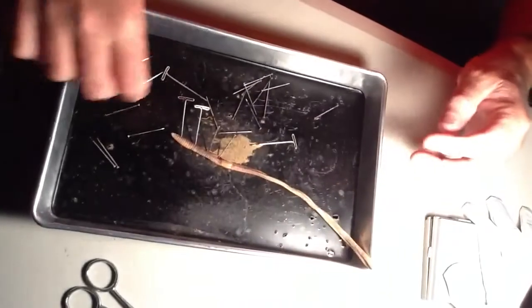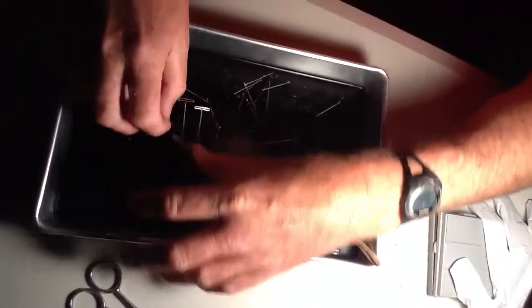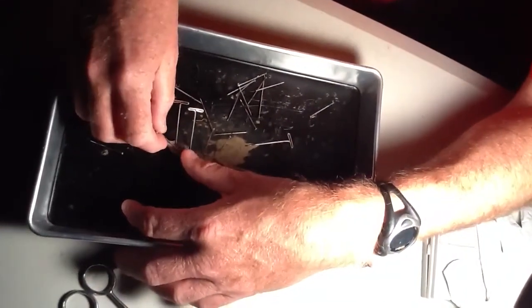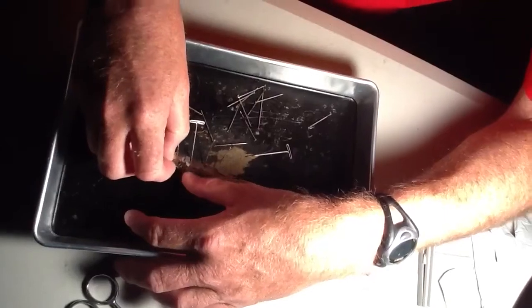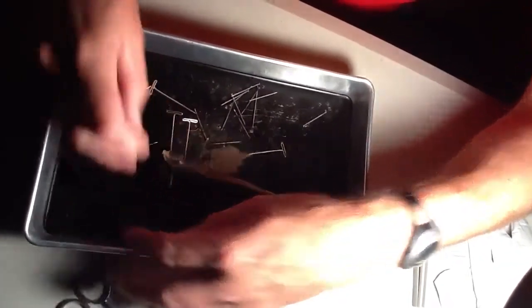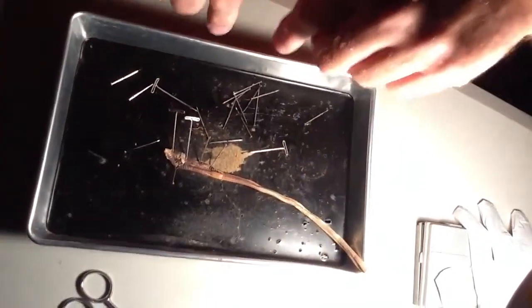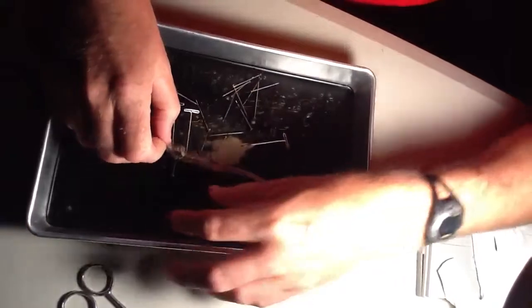So I've got one side done. Now I just need to do the other side. To do the other side, it's the same thing. I'm just going to take it, open it up, put a pin underneath the skin and scrape the septa, which is what you're really scraping, the little dividing things. Put a pin in. And again, notice the angle of the pins. They're not straight up and down. They're really wide, so that when you do want to look at them, you can see it better.